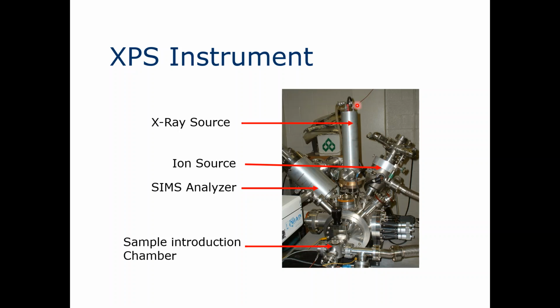This is known as the X-ray source. Here we have the X-ray source, and here this one, you can see that's already been tagged. This is the ion source, and then this one is the analyzer, and below here you can see it's a sample introduction chamber.